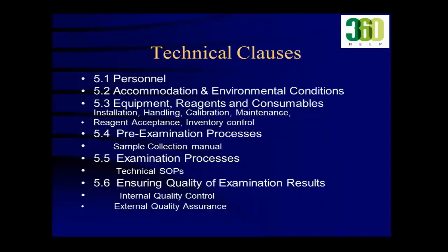Then comes ensuring the quality, as I told you earlier also, the internal quality control and external quality control. So these two are the backbones of quality. This is the most important clause, how you have to control your quality day to day and how you have to compare your results intermittently with other labs, right?